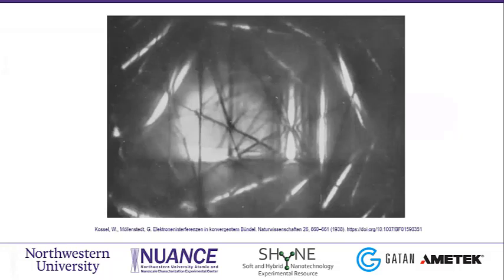So to start, I really like to start my talk with this diffraction pattern here. This is one of the first, if not the first, convergent beam electron diffraction patterns taken. That was back in 1938. You might recognize some of the names like Kossel and Möllenstedt. They did this, if I remember correctly, on a mica sample, and it was done at 45 kilovolts.